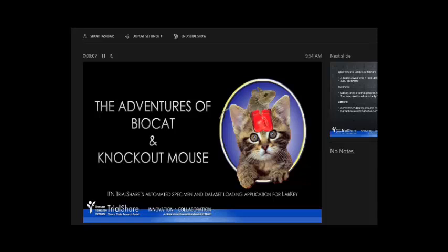We're jumping the gun, but since I don't have any good screenshots to show you, I thought we'd go ahead and use some cheesy Photoshop graphics. So our issue was that we had two cases, one for data sets and one for specimens, and the differences between those is that the specimens, we want those to refresh every night. All our different repositories send us specimen.